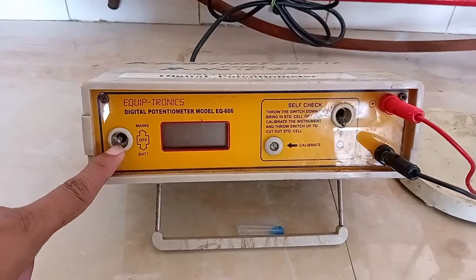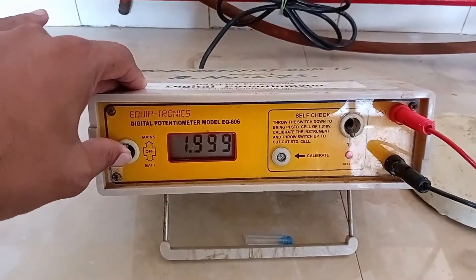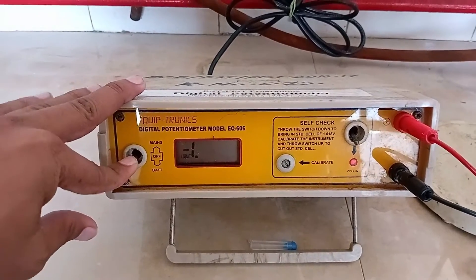This is the ON-OFF knob. When shifted UP, the instrument is ON. When shifted to MIDDLE, the instrument is OFF. When shifted DOWN, the instrument shifts to charging mode.